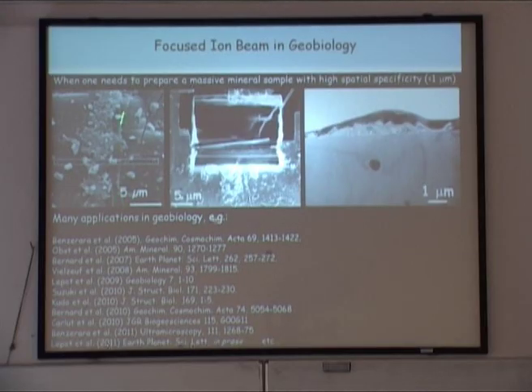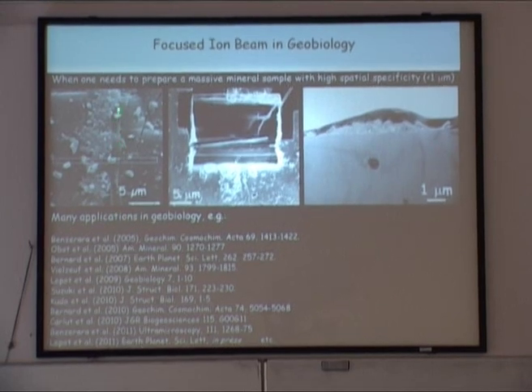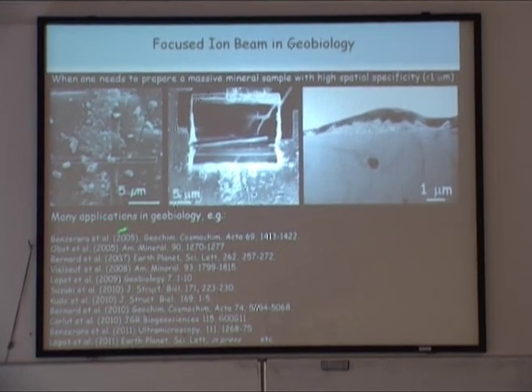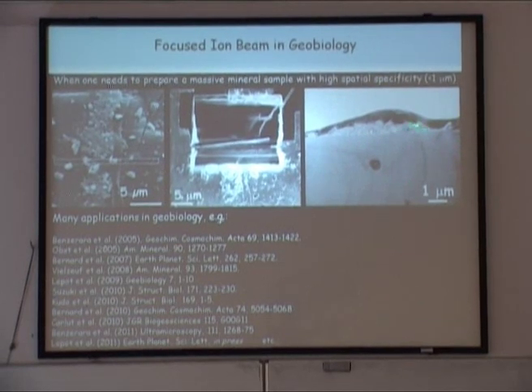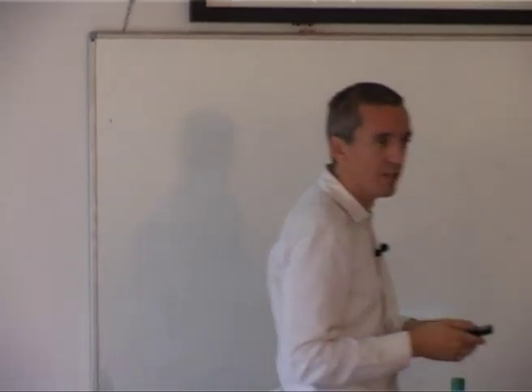Here, this is a cell, a fungus that is lying at the surface of a mineral, and you can cut across it, and this is TEM picture of this cross-section. And here you see the fungus cell, it's here. You see the crystal on which it is lying, and you see some crystals that are formed at the surface of these crystals and close by to this cell. So you can really preserve also those assemblages. Okay?